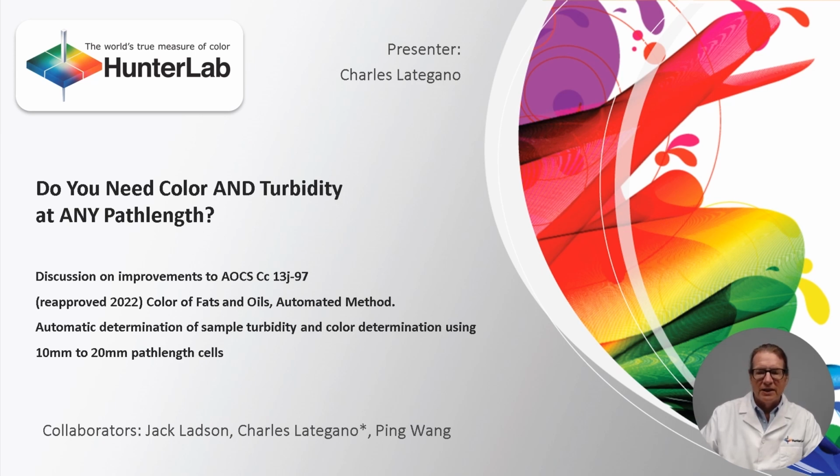My name is Charles Lategano, and I've been a color scientist at HunterLab for the last 16 years. Today, we will describe a way to improve the current AOCS 13J method.